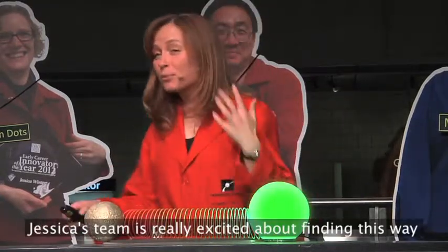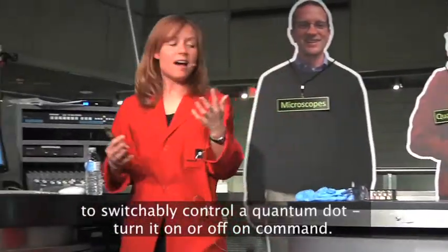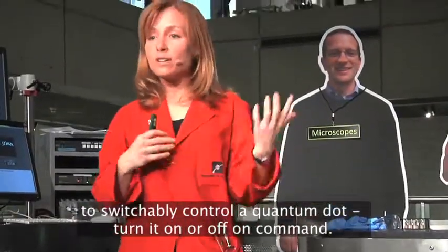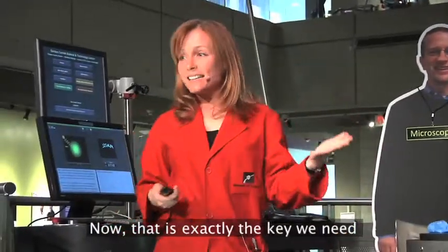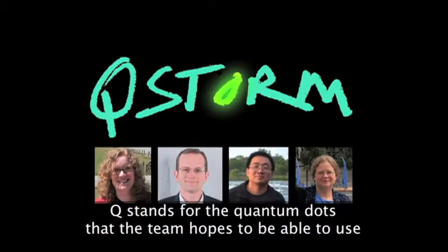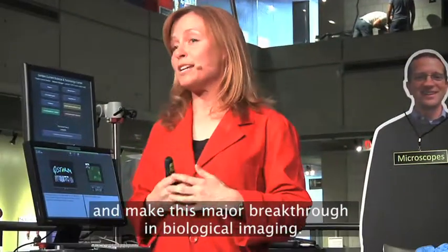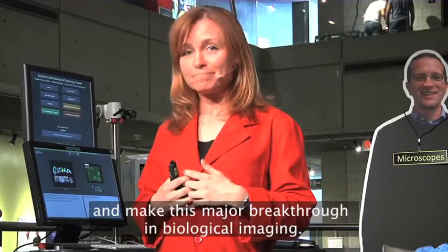So Jessica's team is really excited about finding this way to switchably control a quantum dot, turn it on or off on command. Now that is exactly the key we need to put the Q in QSTORM. Q stands for the quantum dots that the team hopes to be able to use to improve the resolution of STORM imaging and make this major breakthrough in biological imaging.